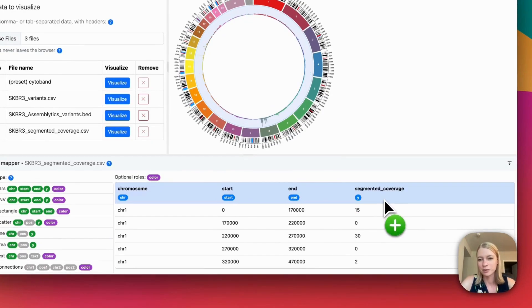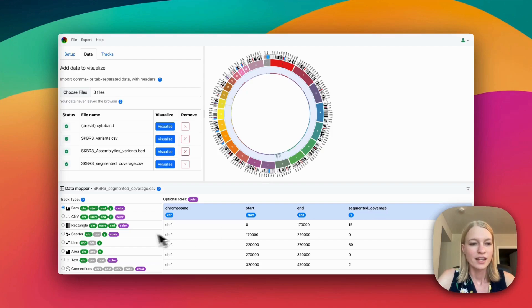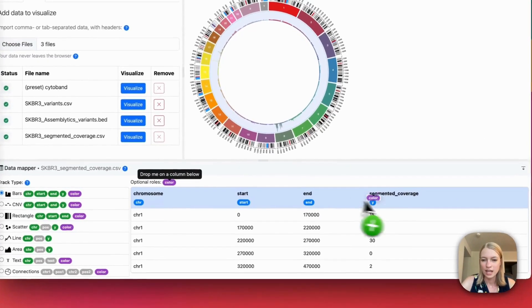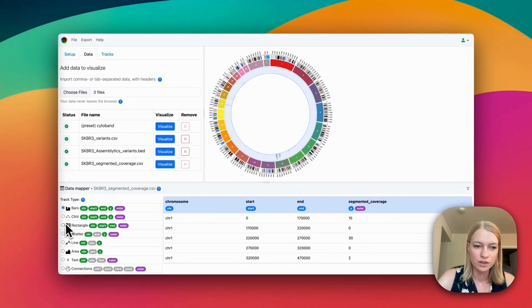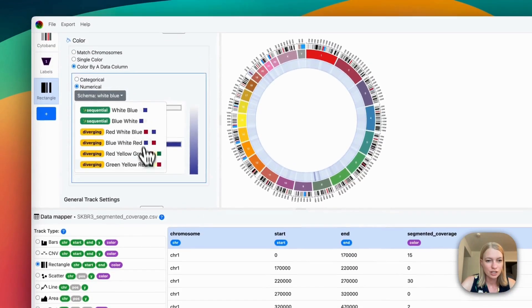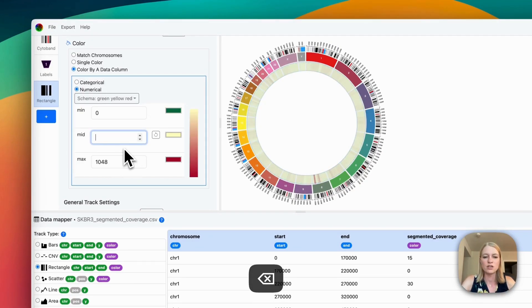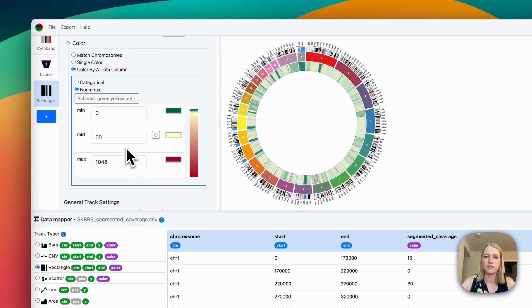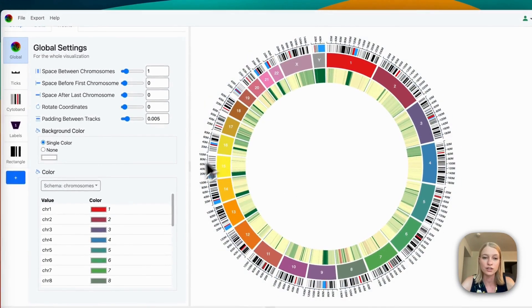Or you could actually plot by something real in your data, like the segmented coverage, and not just the position. You can also drop the color tag onto the segmented coverage, and now we have a heat map. Let's change it to a rectangle chart to get a more traditional heat map, and we can change the color scale — let's say set it to 50 — and you can standardize it to be the same for multiple tracks.